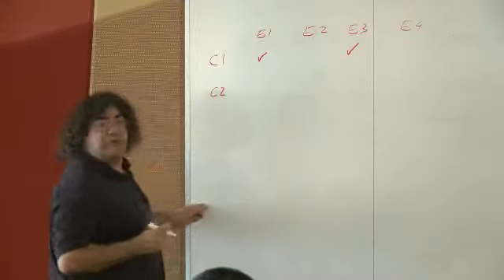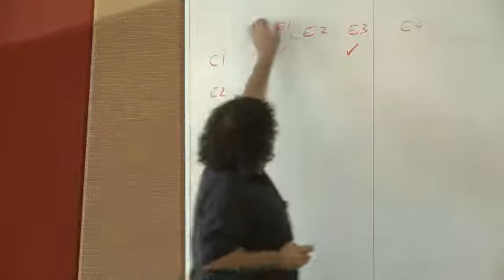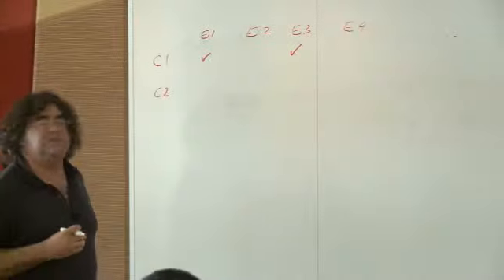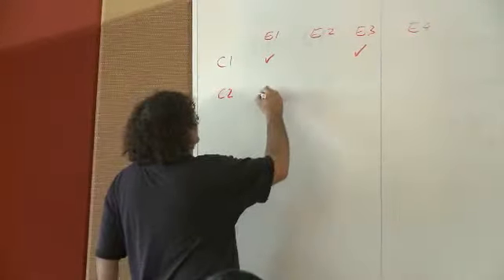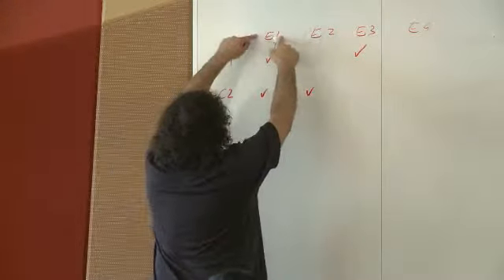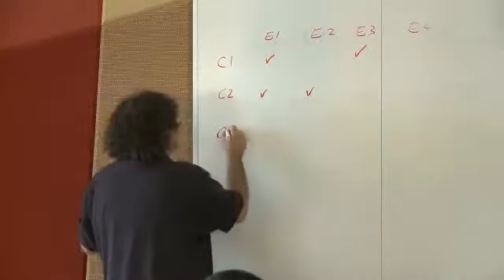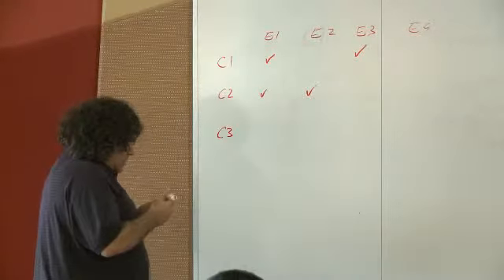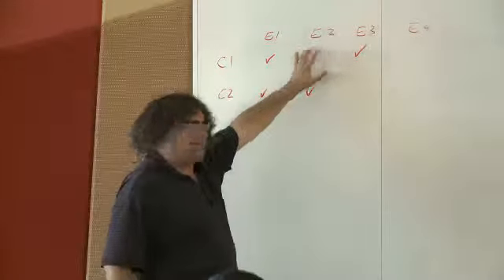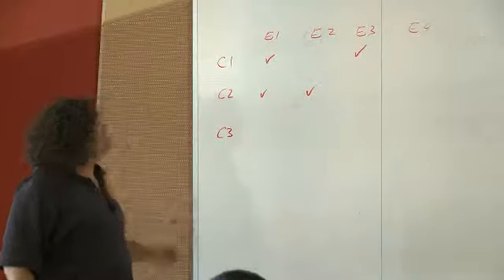And actually, we do this for several cell types, and we combine them, so we can get this kind of master list of all the enhancer elements in the genome that we find when we ask, let's say, 10 or 15 cell types. And for each element, we could say, oh, this element is active in cell type 1 and 2, this one only in 2, this one only in 5. So we can start getting this annotated list of enhancers, and for a particular enhancer, we would know in what cell types it's active or not. That's interesting information.